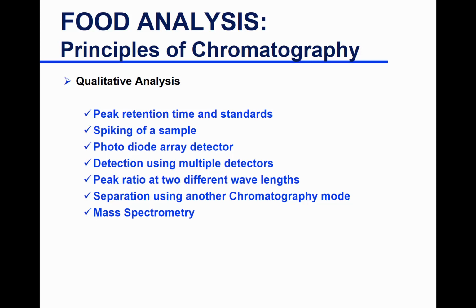A more powerful technique for identification is mass spectrometry, where you actually get the molecular mass.